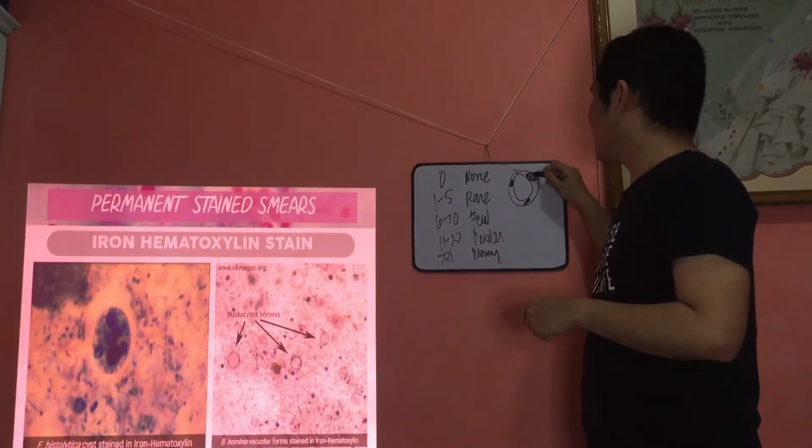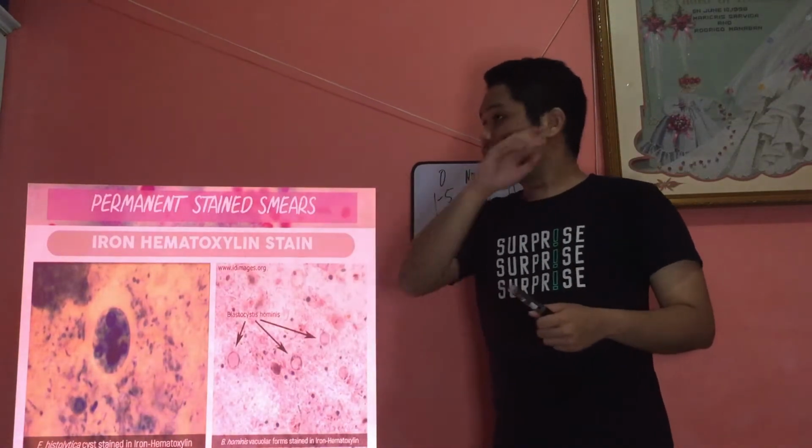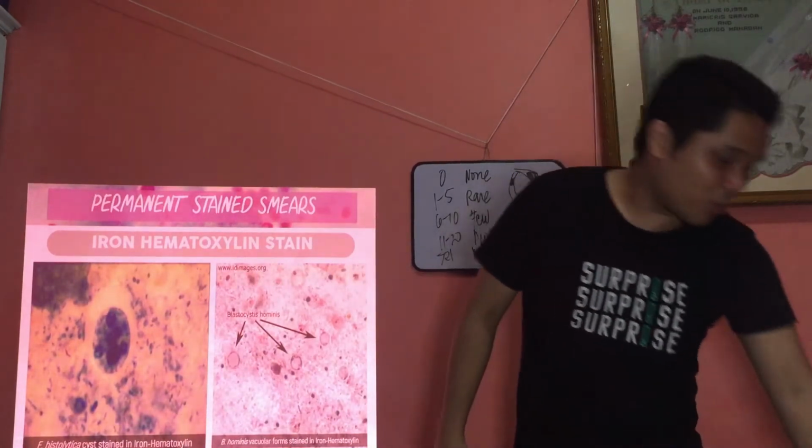That's the vacuolated form, the vacuolar form. Not sure about the other form; I forgot the name for Blastocystis hominis. Okay, all right, that's for iron hematoxylin.